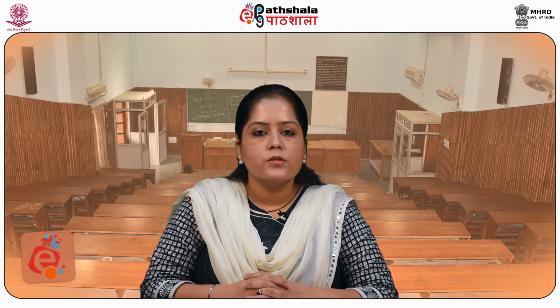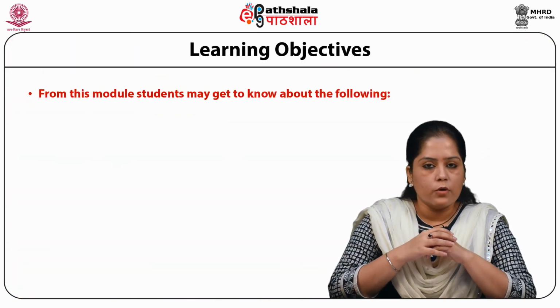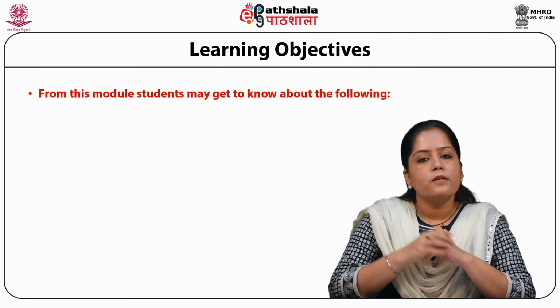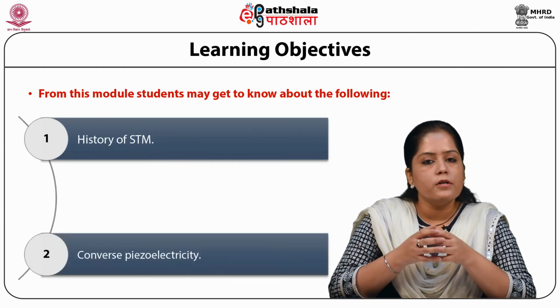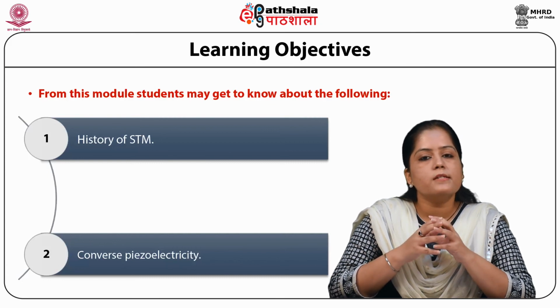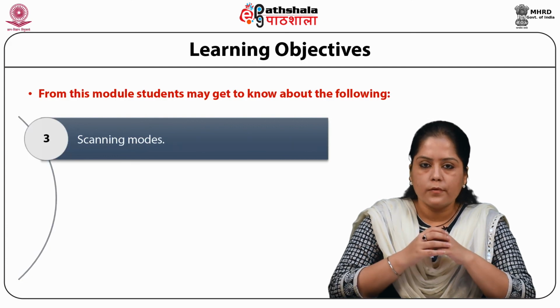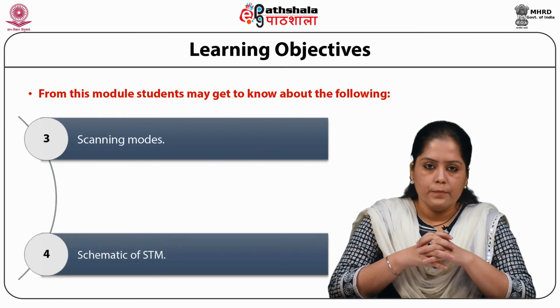So students, today we are going to discuss the module Scanning Tunneling Microscope, STM, from the paper Physics at Nanoscale. The learning objectives of this module are: first, we will discuss the history of STM. Next, the converse piezoelectricity effect will be discussed. Then we will discuss the different scanning modes of STM. Then we will discuss the schematic of STM.